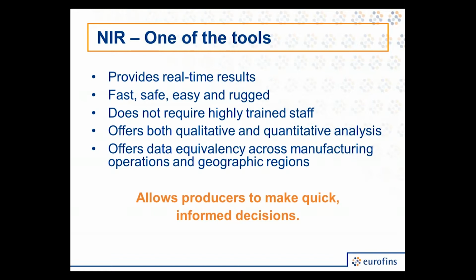Near-infrared is a secondary technique, and it is calibrated by analyzing a set of known samples, with analysis time typically being less than 1 minute to achieve multiple trait results on a single sample or single scan. It provides real-time results that can be used to directly impact the manufacturing process.